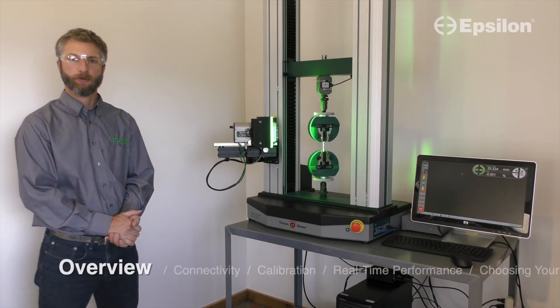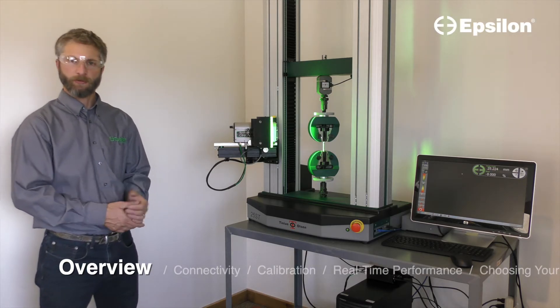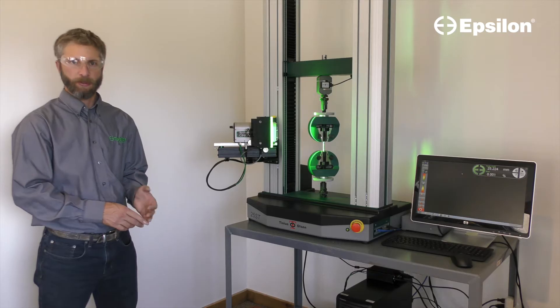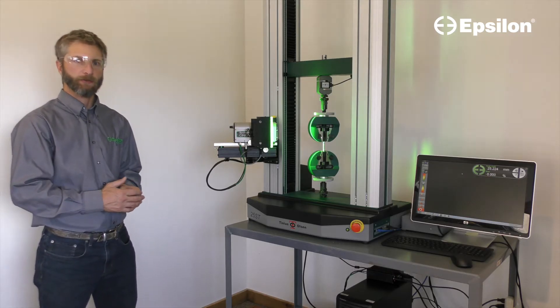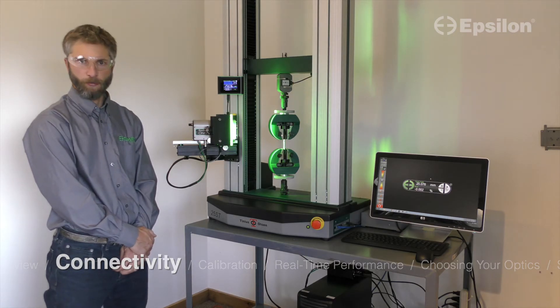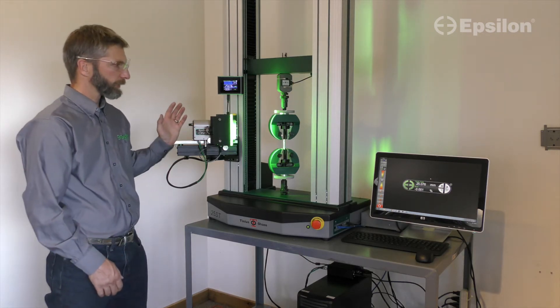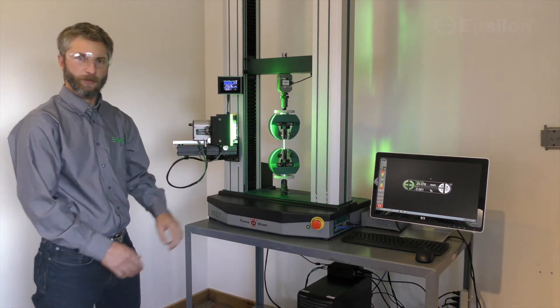Let's have a look at the new Epsilon-1 system. The overall system design of the Epsilon-1 uses a non-contact extensometer that's designed to interact like a mechanical extensometer. The primary connection of the Epsilon-1 to your test frame is through a high-speed plus and minus 10 volt analog output channel. The Epsilon-1 can connect to any test frame manufacturer, regardless of the PC and control system.